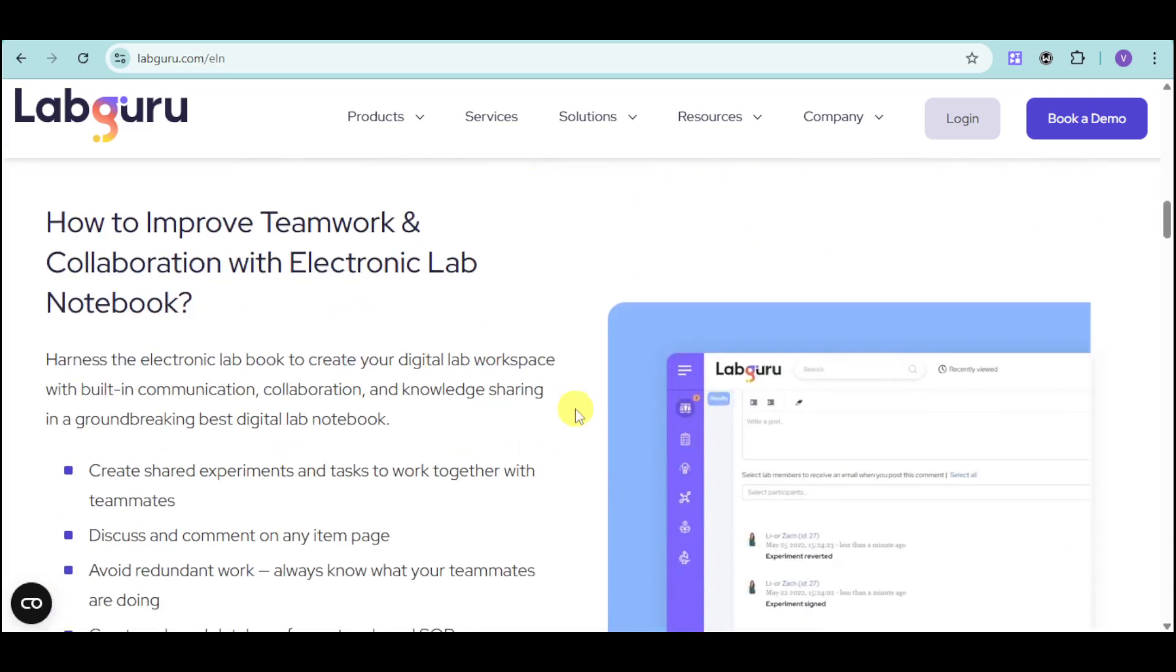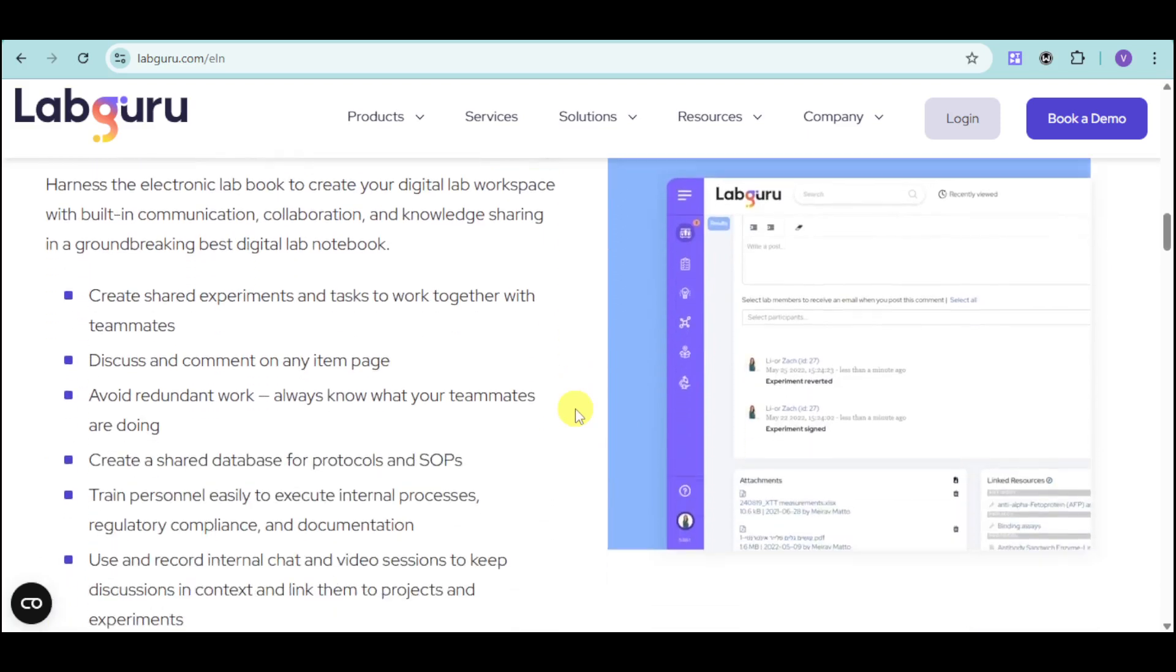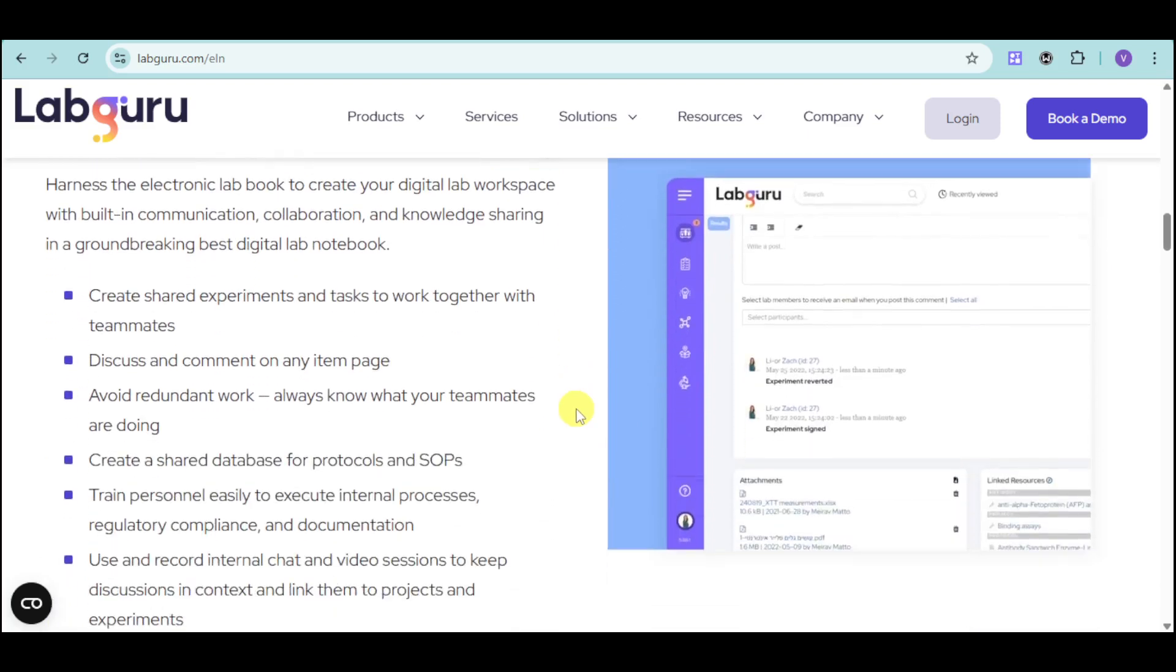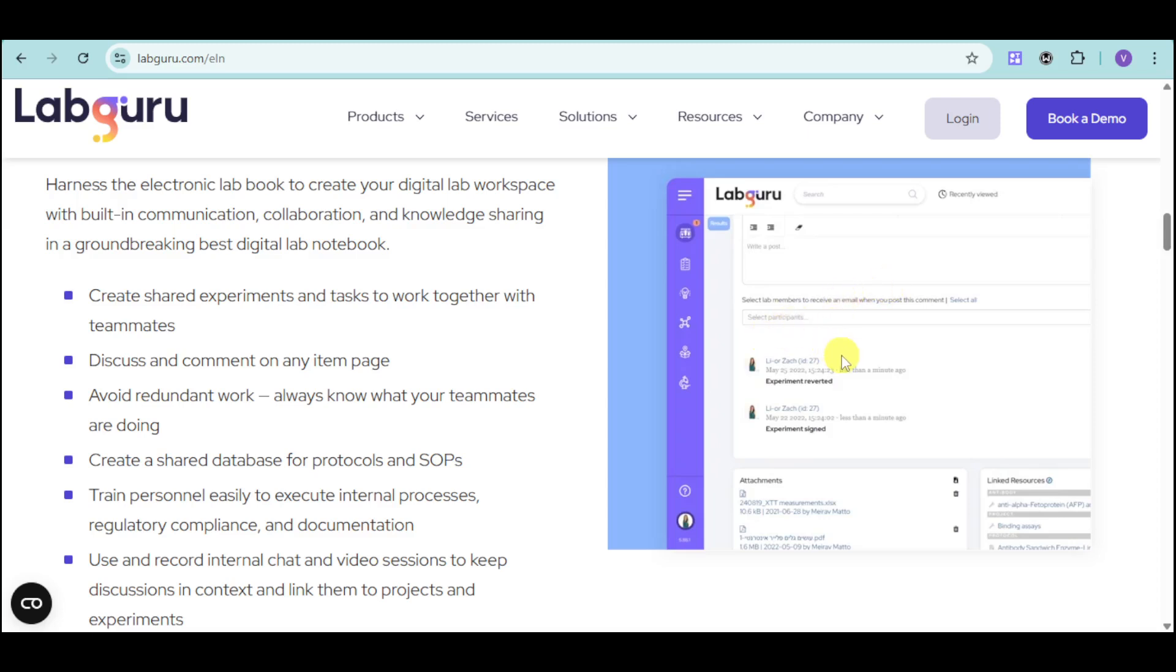You can also improve your teamwork and collaboration. You can share experiments and tasks to work together with your teammates. We have attachments, link resources. You can select participants that can actually help you with this particular experiment. You can also discuss and comment on any item page.